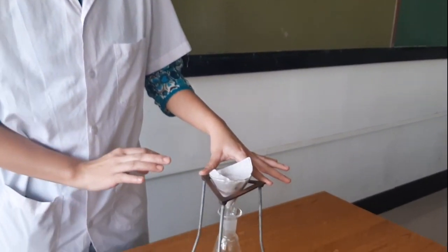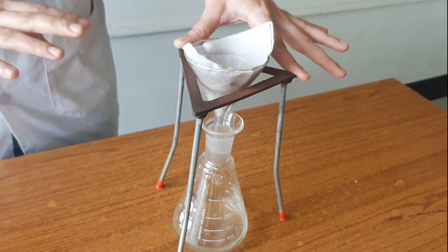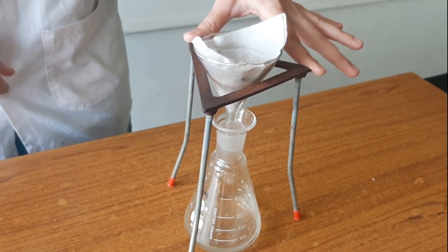Now we are at the end of the filtration process, and it is completed. Just the last drop has fallen, and it took almost 5 minutes and 16 seconds for the process to be completed.